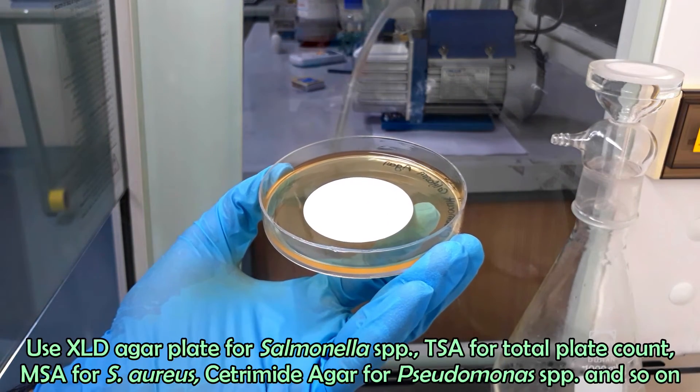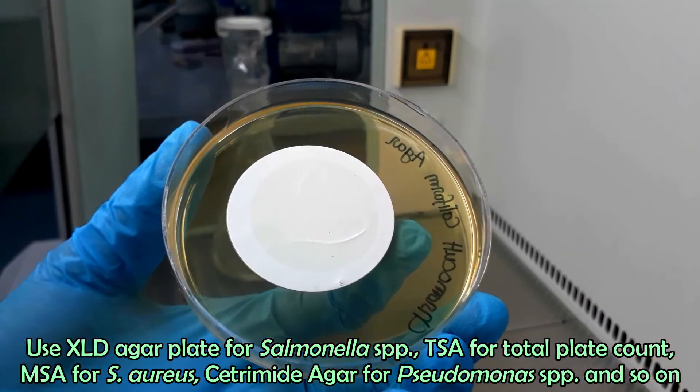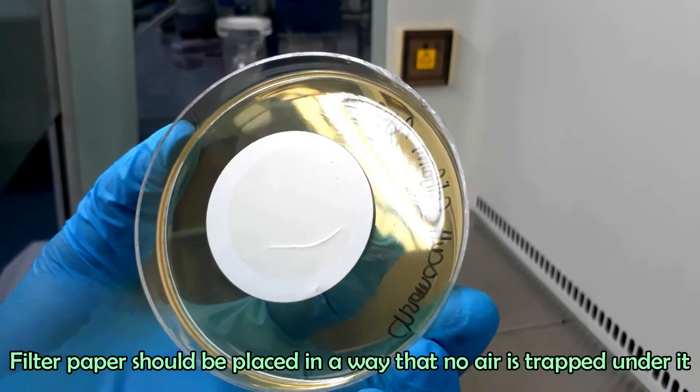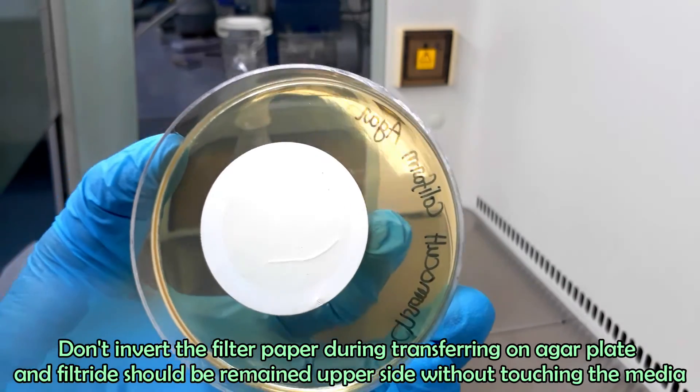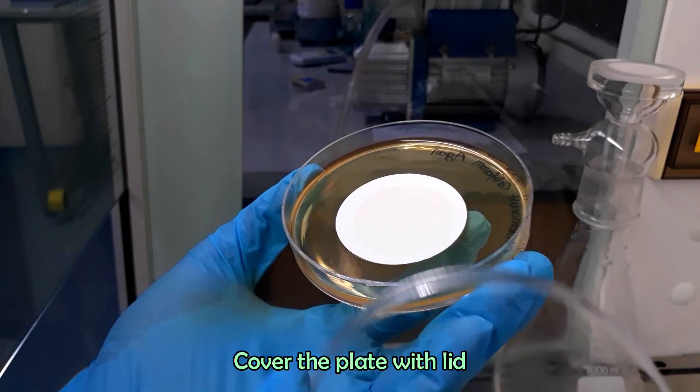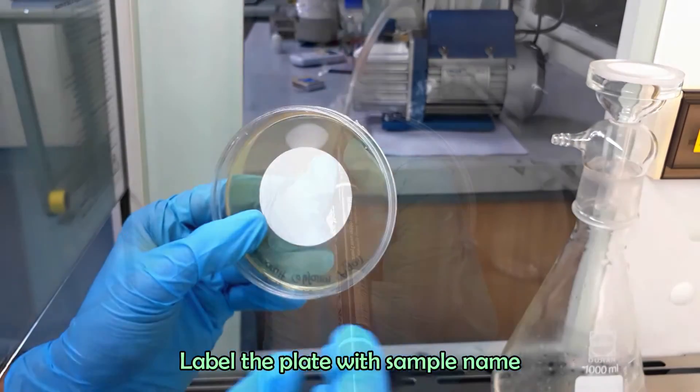Filter paper should be placed so that no air is trapped under it. Use XLD agar plate for Salmonella species, TSA for total plate count, MSA for Staphylococcus aureus, cetrimide agar for Pseudomonas species, and so on. Cover the plate with a lid and label the plate with the sample name.